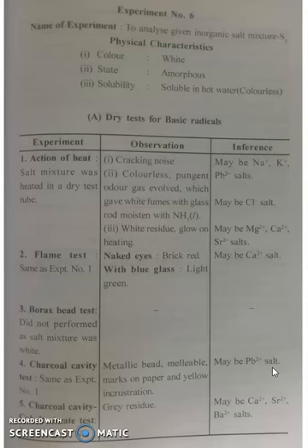In the same way, do the first experiment: salt mixture was treated with cold and dilute hydrochloric or sulfuric acid. When you perform it, if you observe no effervescence and no characteristic gas evolved, then maybe carbonate, sulfide, NO2 minus nitrite, acetate, absent.